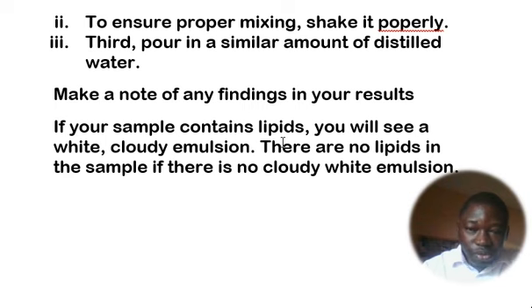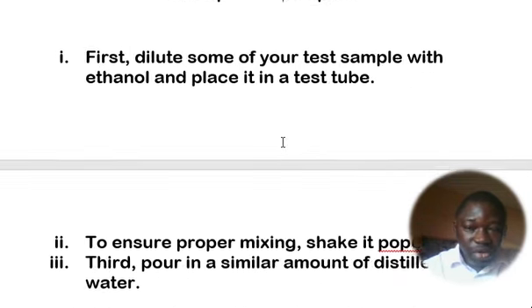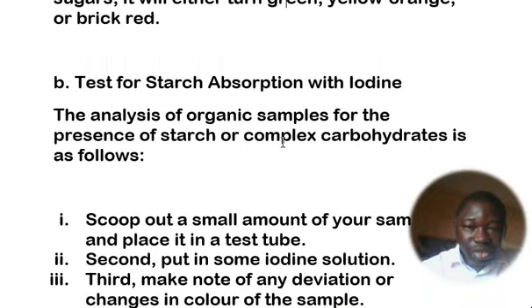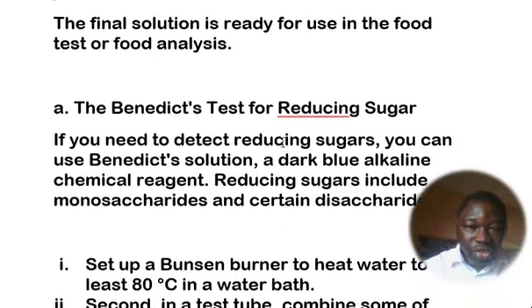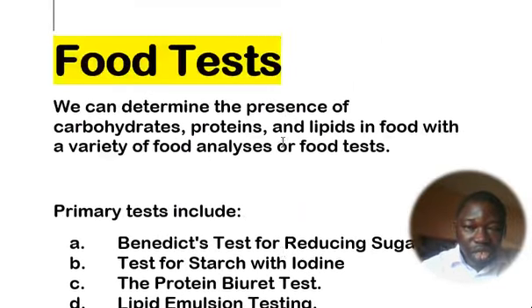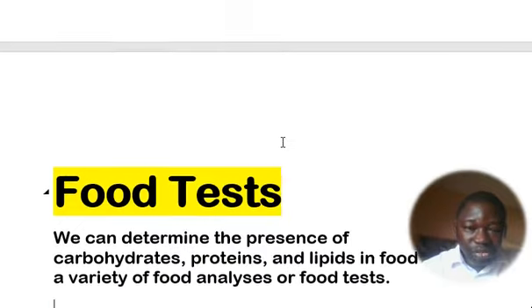So this is where we're going to stop on the test for protein, test for starch, test for reducing sugar, and then test for lipids. Very shortly, you are going to handle all these, and you are going to see them as I've explained them to you.